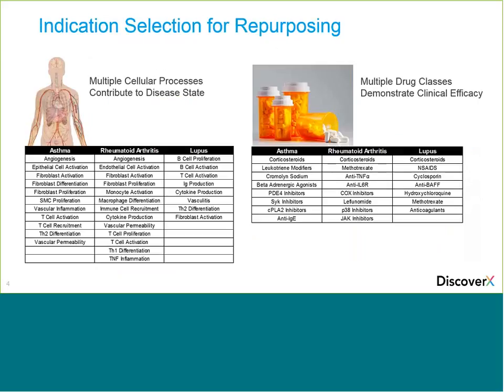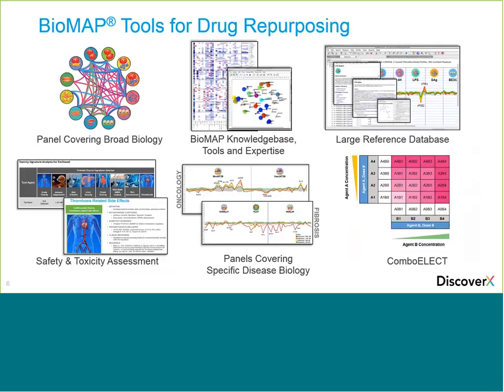As you know, multiple cellular processes play a role in any one disease, which is why approved treatments can represent various target classes. Likewise, there may be additional molecular drivers of disease that have not yet been identified. Target-agnostic phenotypic screening offers the advantage of modeling the complex drivers of disease while also allowing for the testing of various hypotheses.